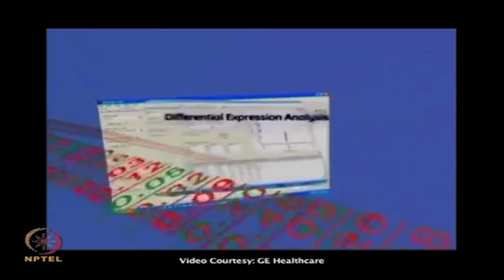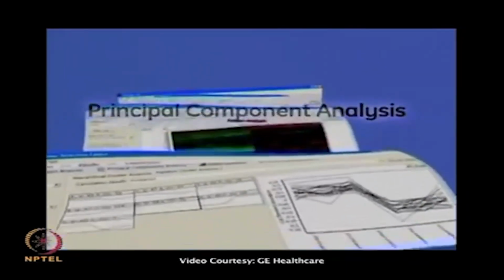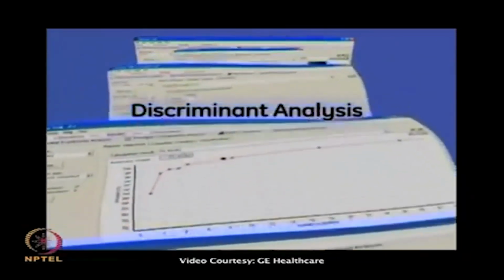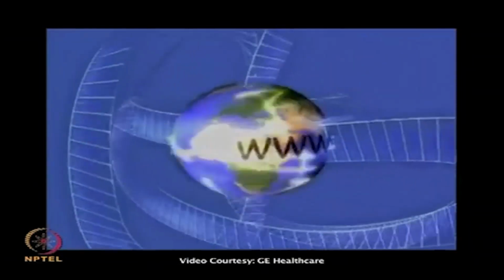Here you will have lots of stringent statistical data: differential expression analysis, pattern analysis, discriminant analysis, and PCA analysis.